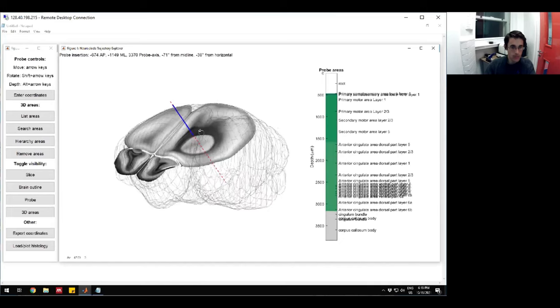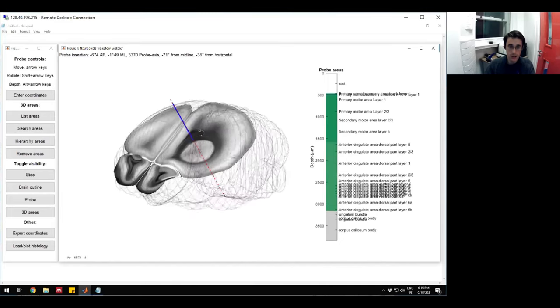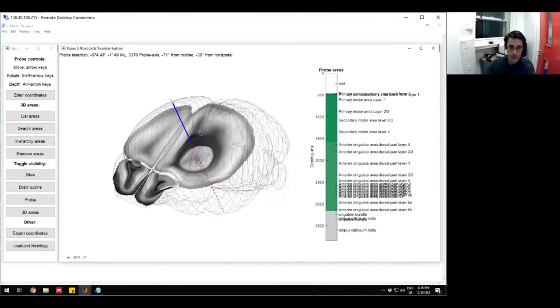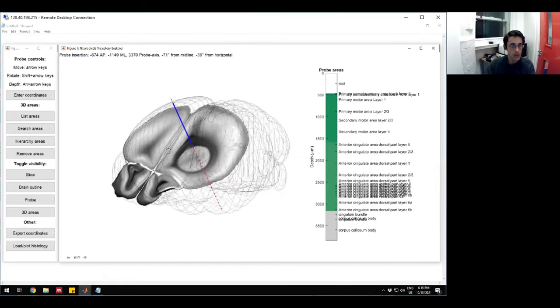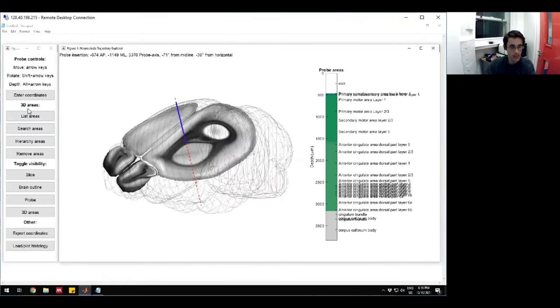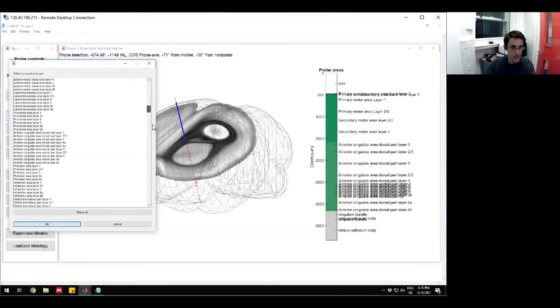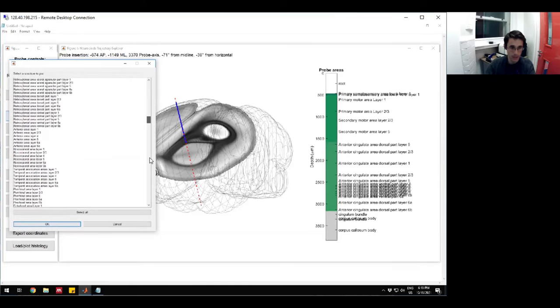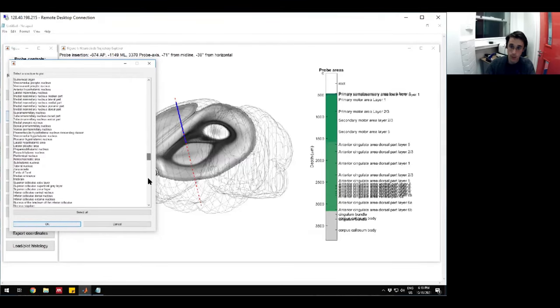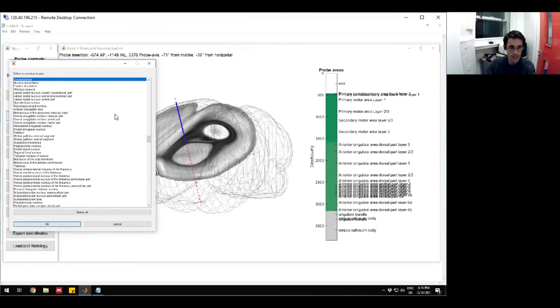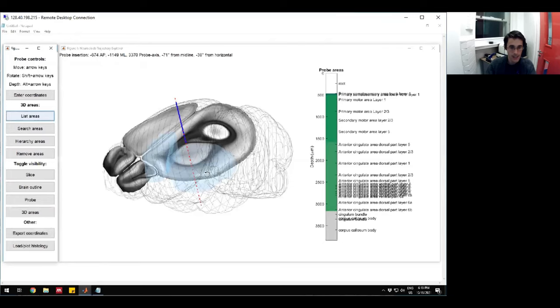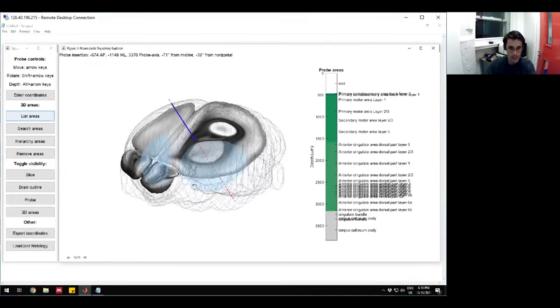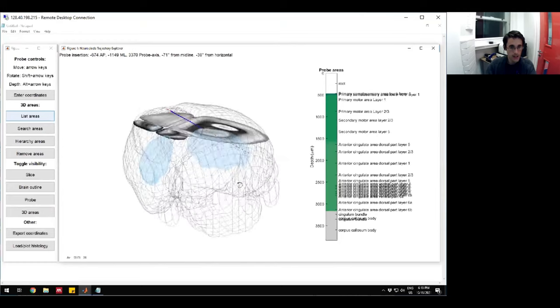When you're planning your trajectory, you're going to want to see the areas that you're trying to hit, and then you're going to move your probe to hit those areas. The way we do that is with these buttons over here under this 3D area category. The first is with this list areas. This lists every single parsed thing within the Allen Atlas. You can scroll down and you can pick your favorite. The thing I'm interested in is the striatum, which the Allen CCF calls the caudoputamen. If I hit okay, then it will draw the striatum in this 3D structure here.